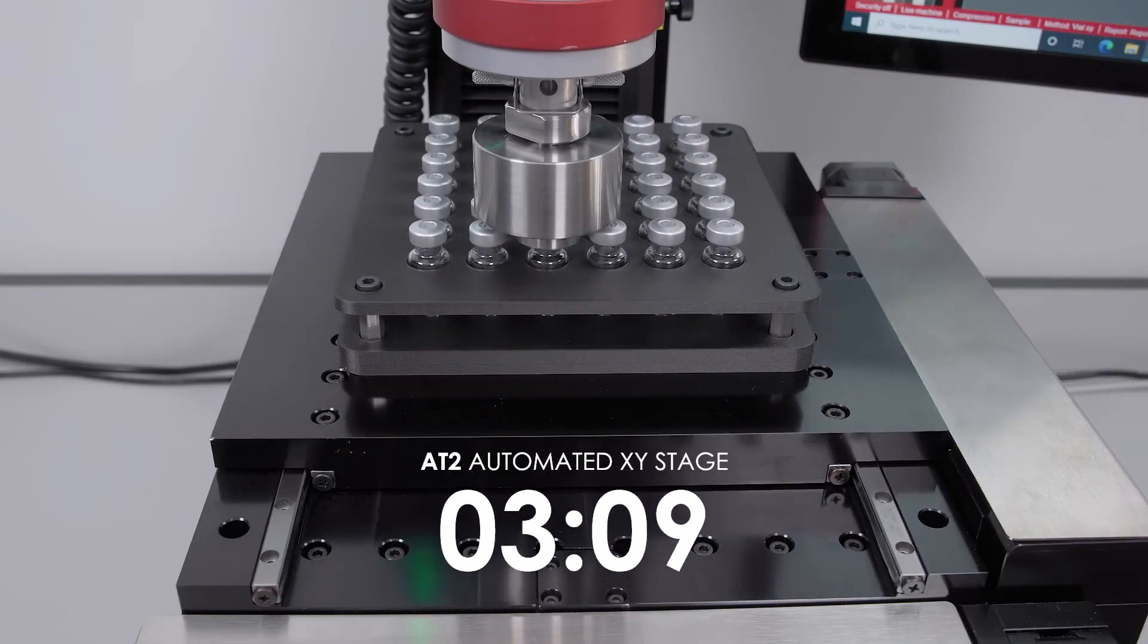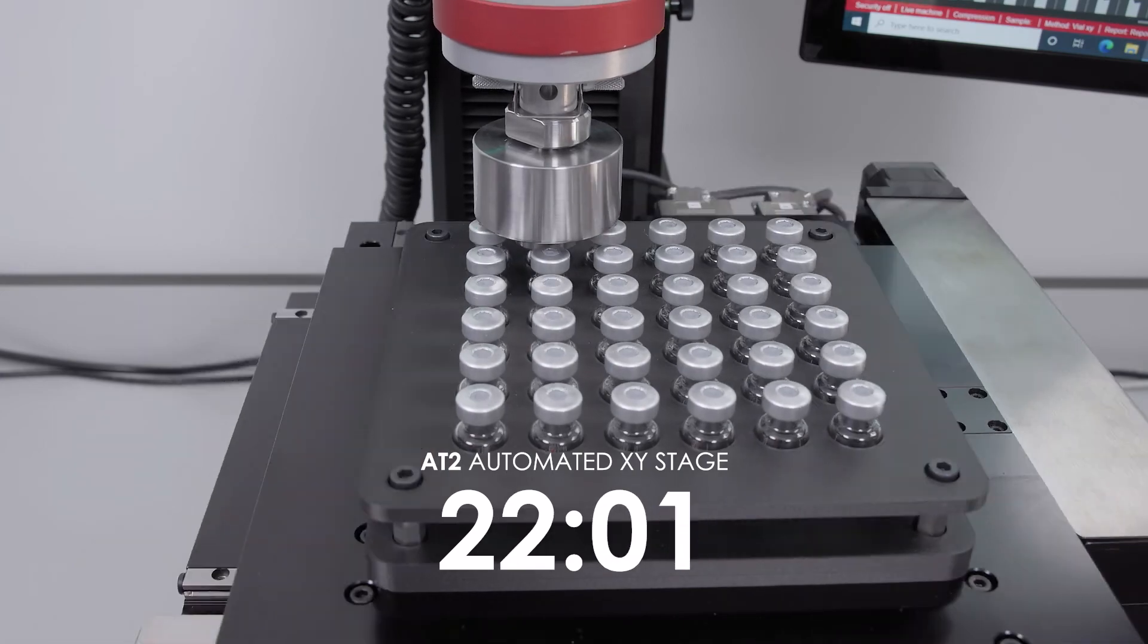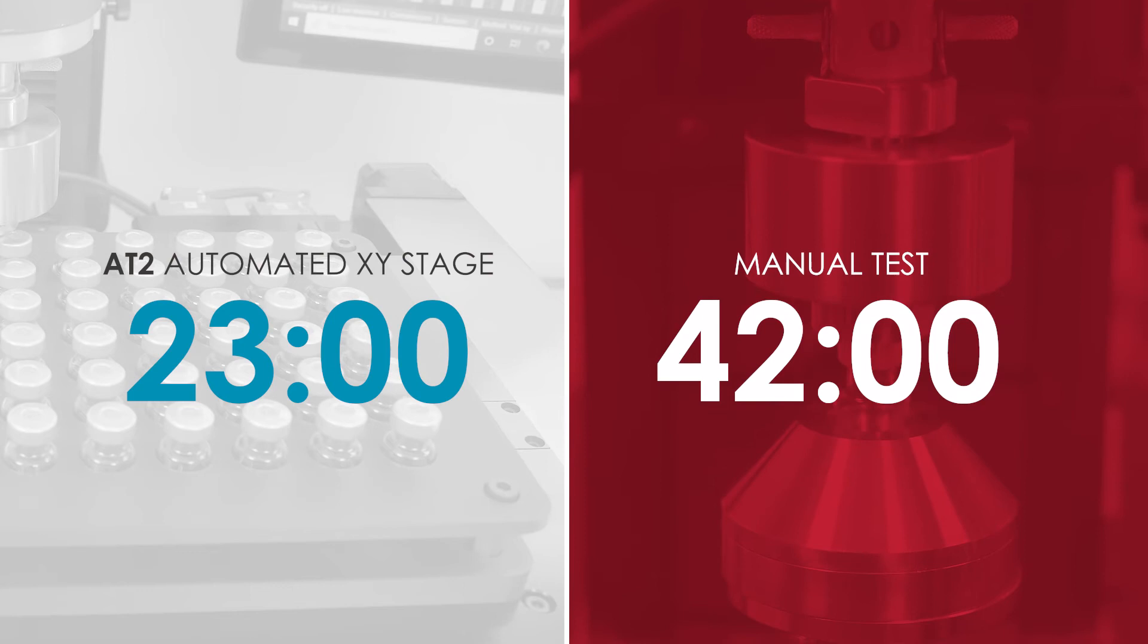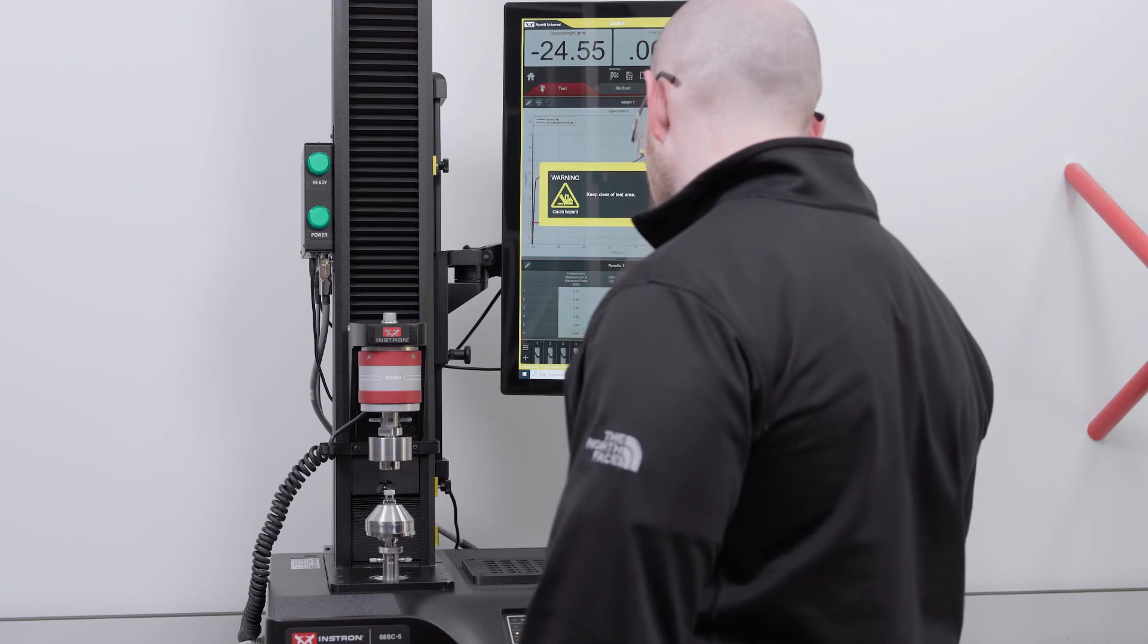In this example, it took 23 minutes to complete testing on all 36 vials. By comparison, it took 42 minutes to manually test all 36 specimens individually, and the operator had to stay by the testing system the entire time.